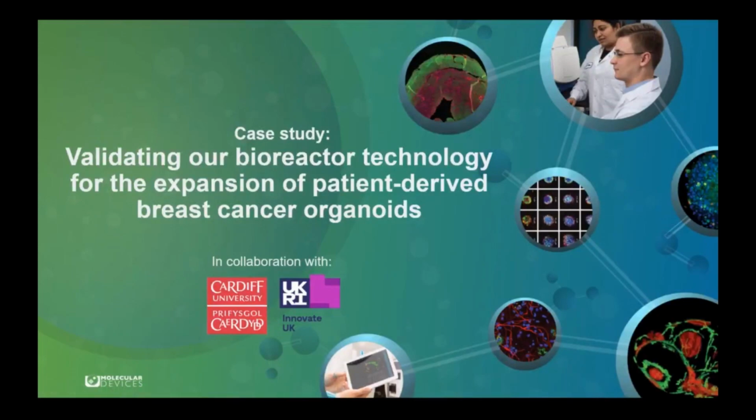Oh, thank you, Andy, for the very nice overview of the organoid expansion technology. For the next part of the webinar, I will talk about two case studies. The first one is a study that looks at the bioreactor expanded organoids, and then these are compared to the manually expanded ones. In the second case study, I will show an application example that uses these organoids in a screening workflow. Going on to the first study, the main aim here is to validate the bioreactor expanded organoids.